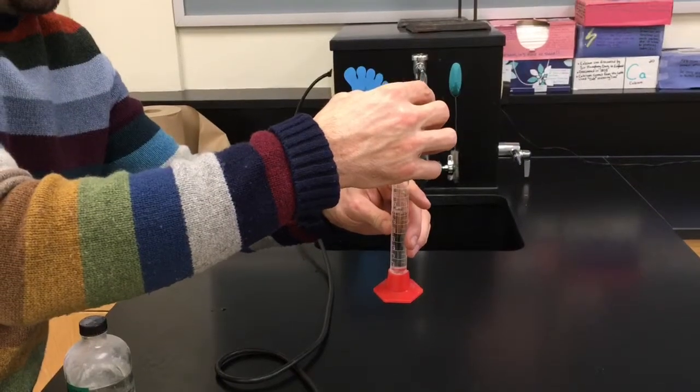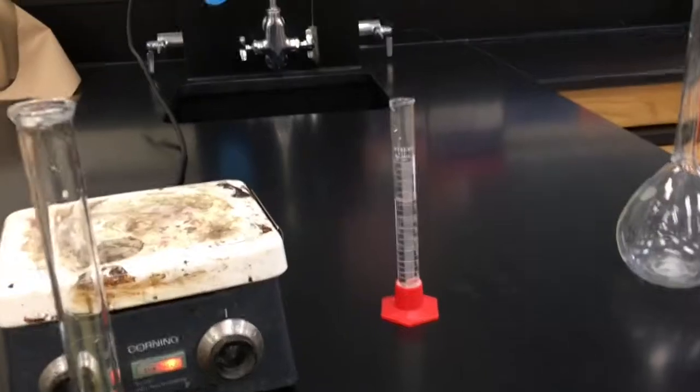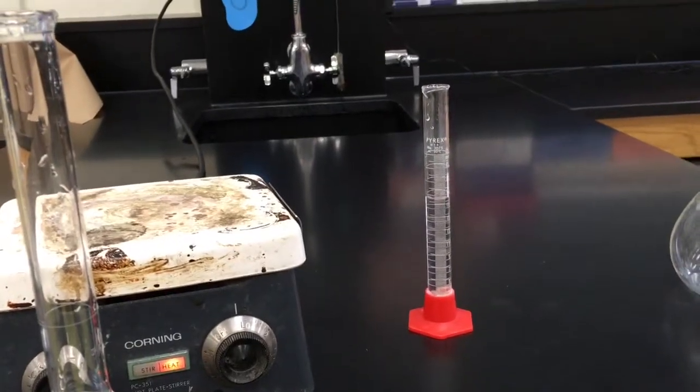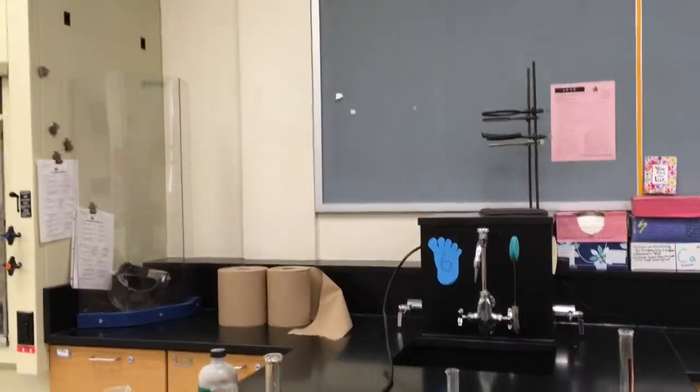Okay. And you want to do that on a level surface. I'm just doing it a little bit above level for the camera, just so you can see it a little bit better. So I don't know if that's exact. It might be. I might have shot it over a little bit. So looks pretty good. It's pretty close. Okay, so now you're ready for your calculations.